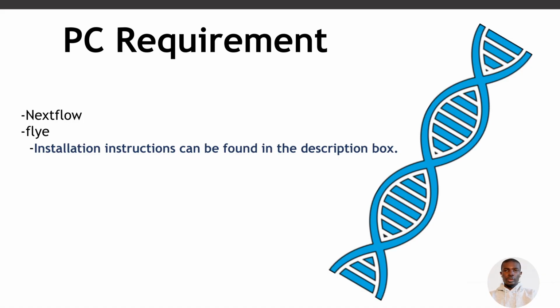For this tutorial, you need to make sure that you have Nextflow installed and you should also have Flye installed. I have tutorials that show how to install these two. So check the description box, you'll find links to those videos. Now let's open the terminal and then start the exercise.